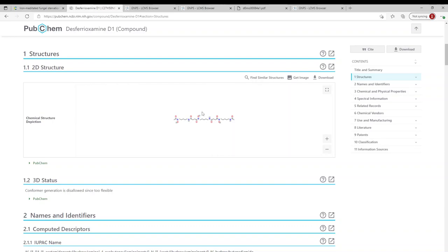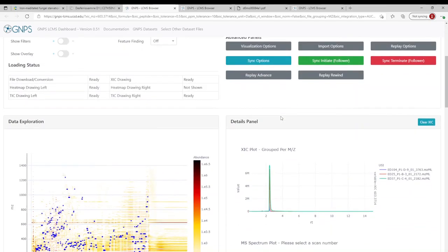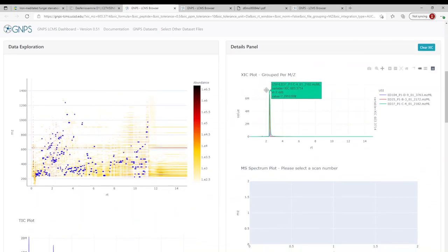So taking desferoxamine D as our dereplication example, we come into the GNPS dashboard and we've placed it into our extracted ion chromatogram settings. So of course, the mass to charge ratio, so the ion that we see in the mass spec. And when we enter this in, we can come down to our extracted ion chromatogram plot.